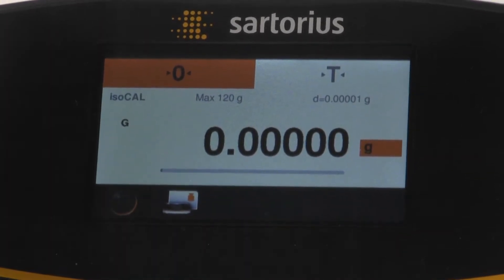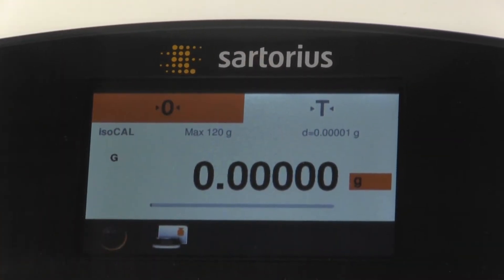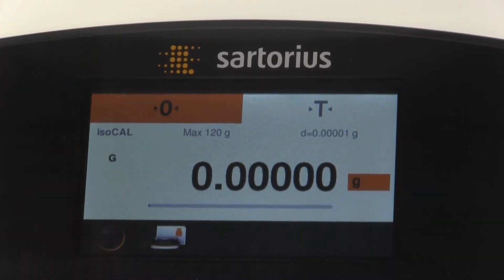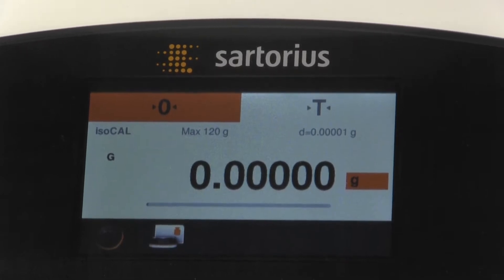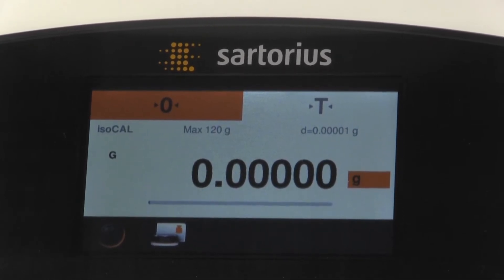You'll notice at the top of the display we have a zero and a T. The zero button icon is to return the balance back to the zero point. The zero function works plus or minus two percent of the weigh-in range.